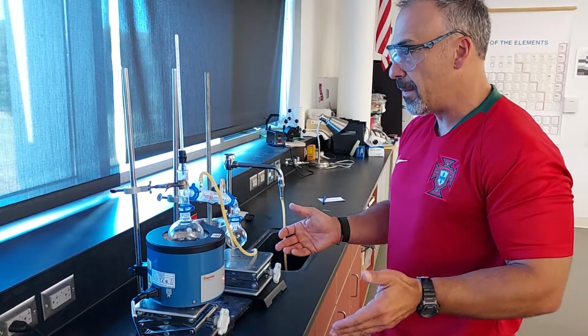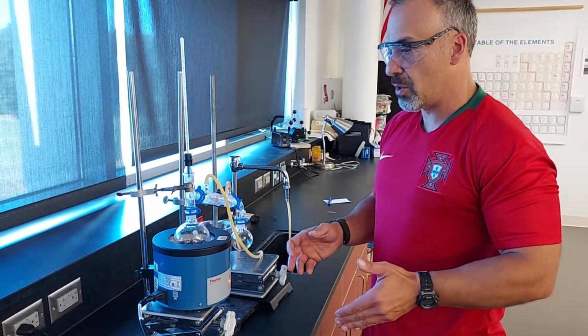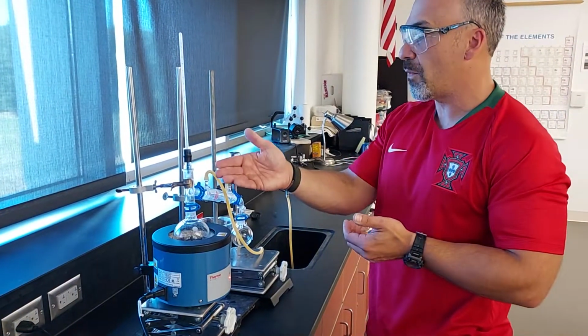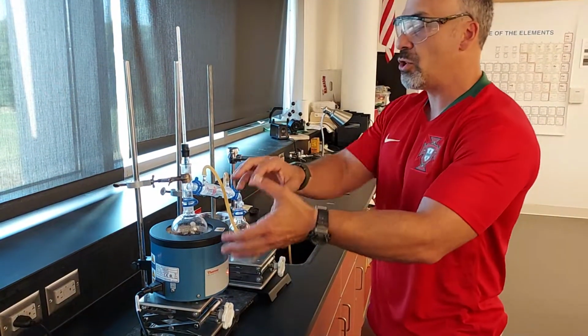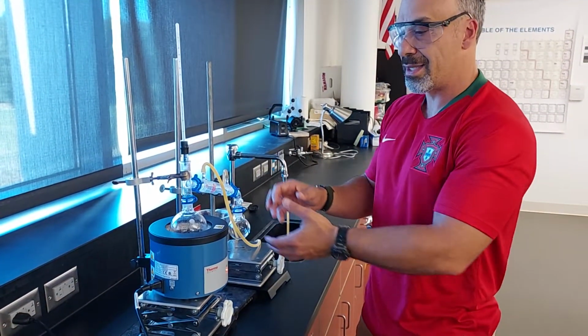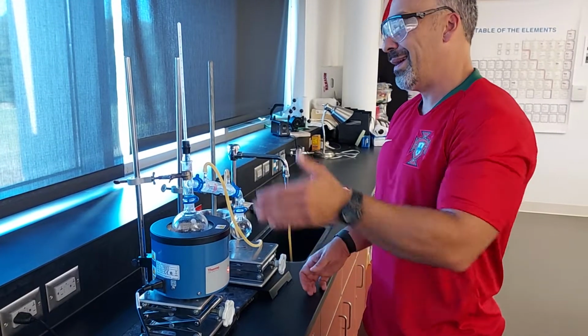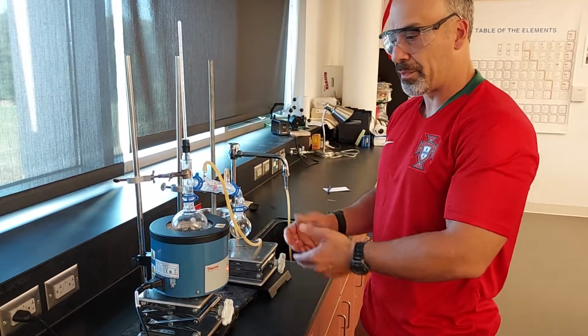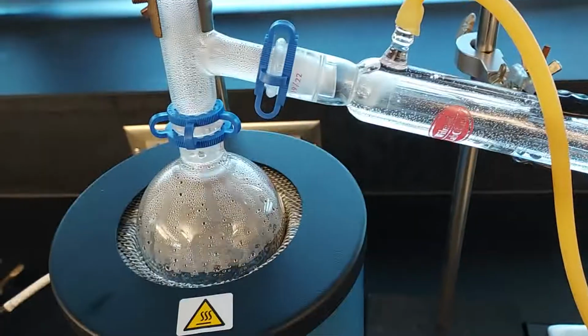And the goal is whatever has the lowest boiling point, which is going to be the most volatile liquid, will come off first. We'll collect that, and it should come off in fractions. It's not going to be perfect, but it will allow me to not drink this soda and eventually just collect water.